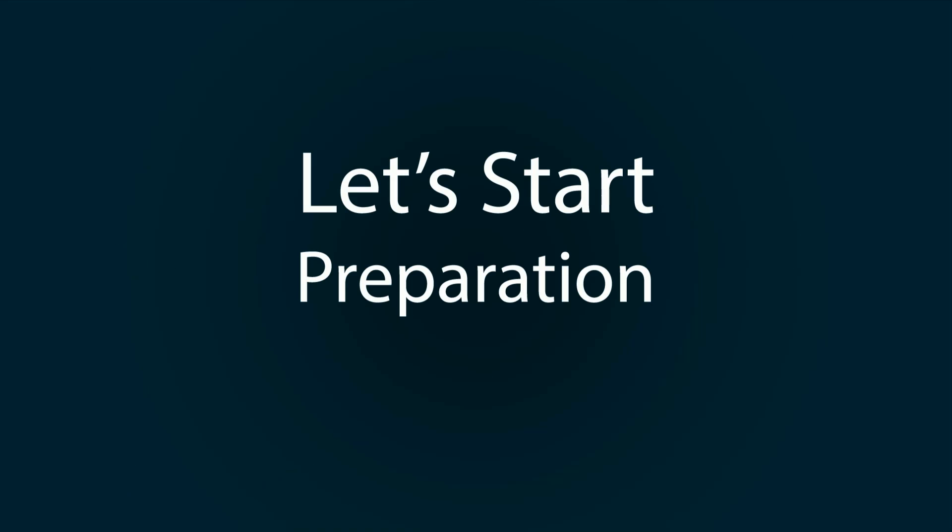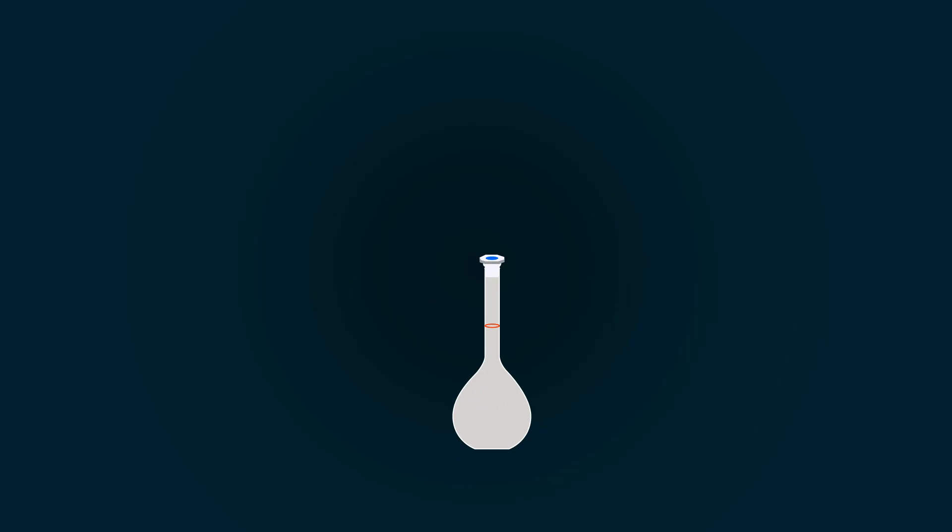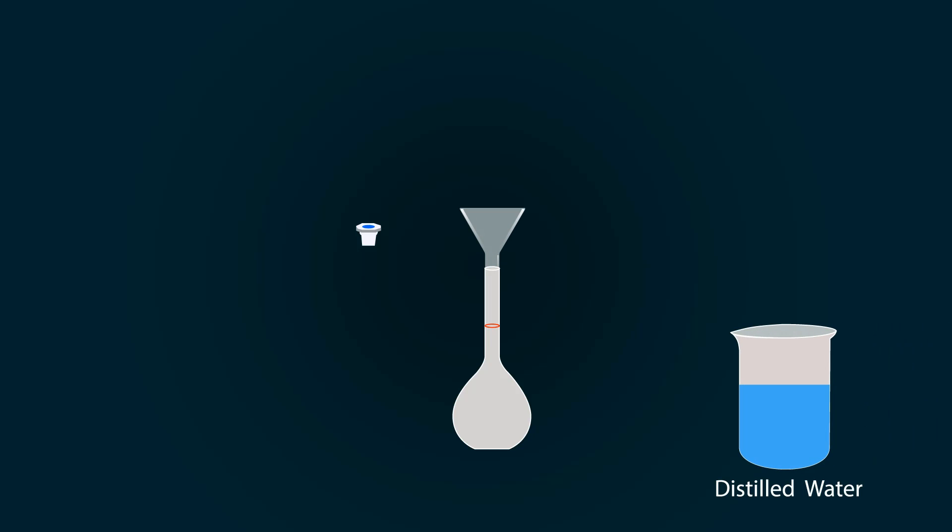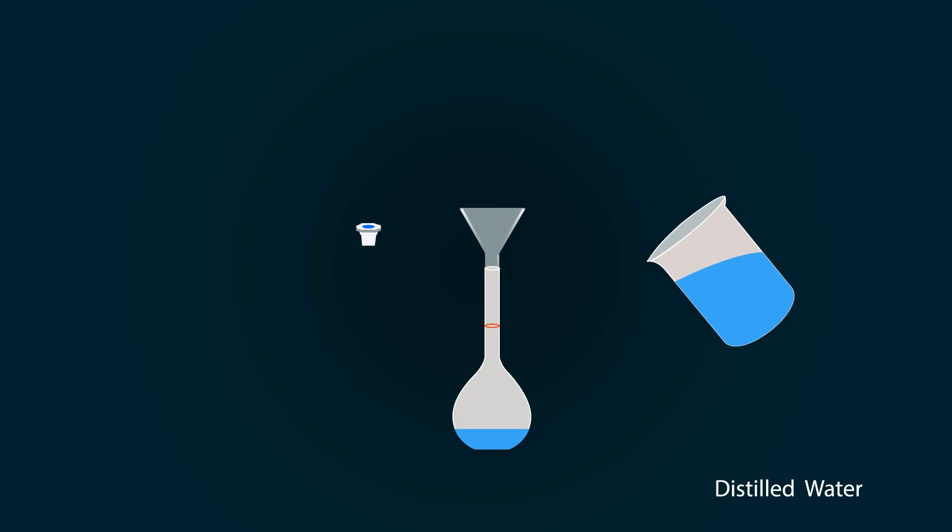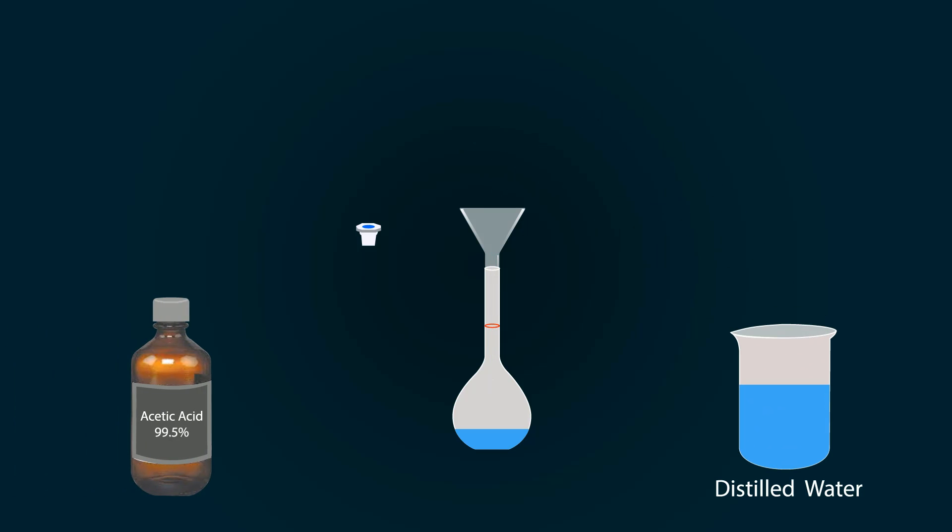Let's start preparation. First, take the volumetric flask and put the funnel on top. Now add some distilled water into the volumetric flask. Do not add acetic acid directly into the flask because the flask may burst.